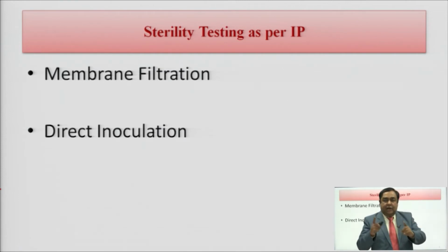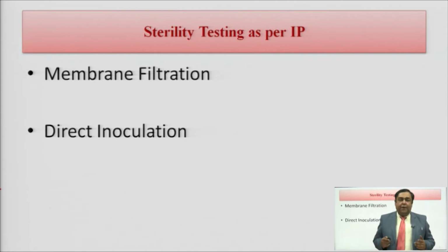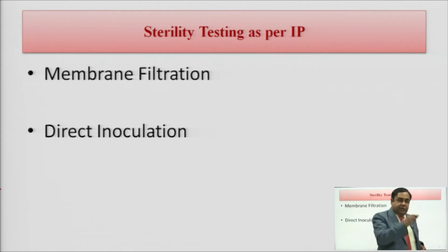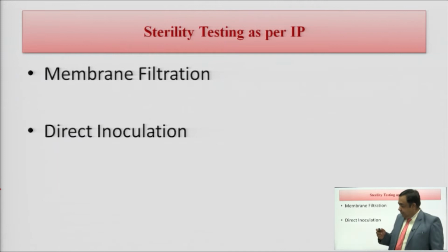There are separate media as prescribed by the Indian Pharmacopoeia. If that media turns turbid, it means there was contamination, or the bacteria or fungus were not removed, which in turn means the product fails the sterility testing.